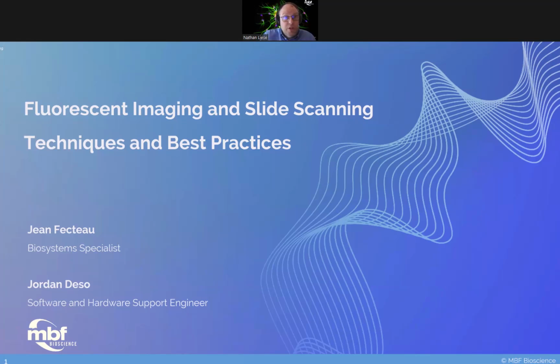I'll start off with some introductions of our topic, our format, and our presenters, and then some info on how to submit a question and interact with us during the webinar. We're going to start off with some background and theory behind fluorescent imaging. Then we'll get into practical use within our software. We'll finish with a Q&A session.